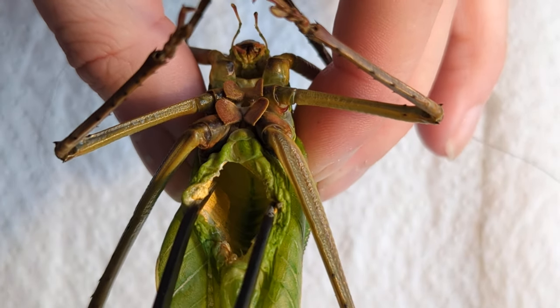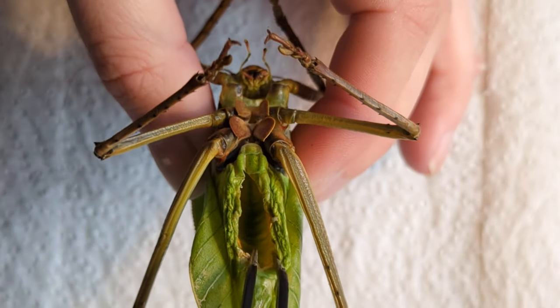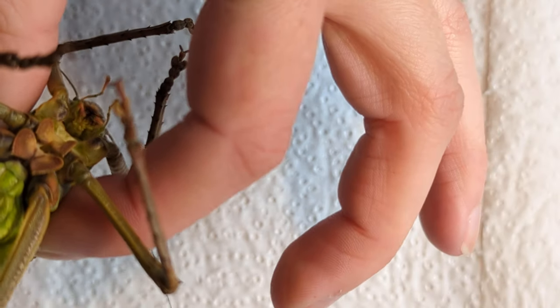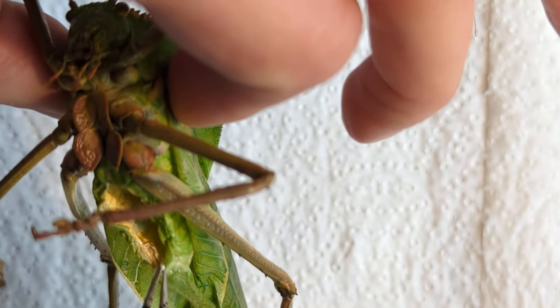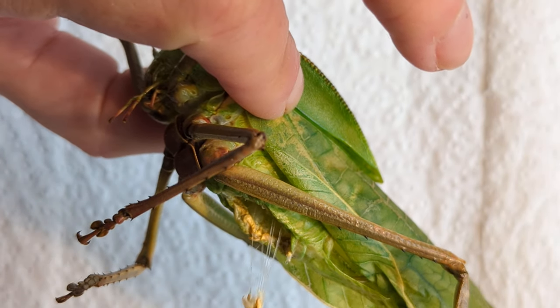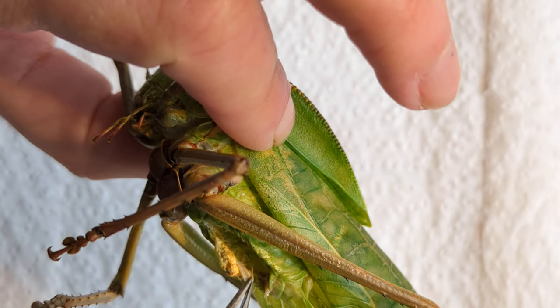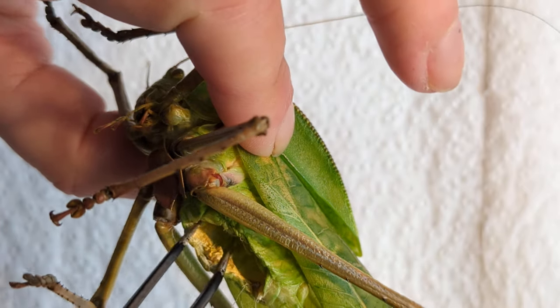In here — that is now entirely hollow. Ta-da! This is what we're aiming for. It's going to look slightly different with every type of insect as they all have different internal anatomies. But the most you can clear out, the better it's going to preserve and hold its colours. Anything you leave in there that can rot will discolour it.